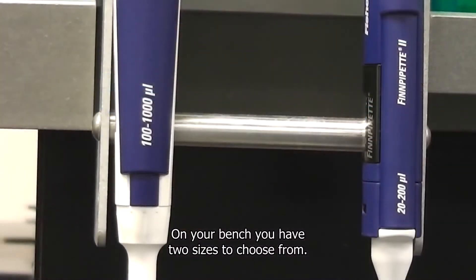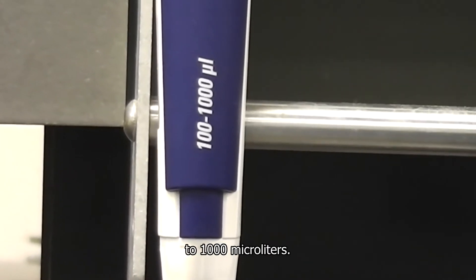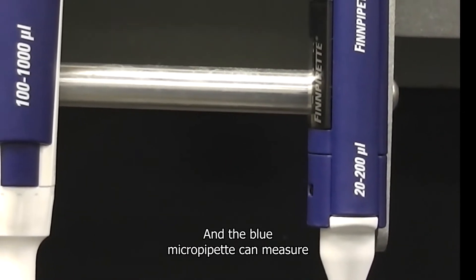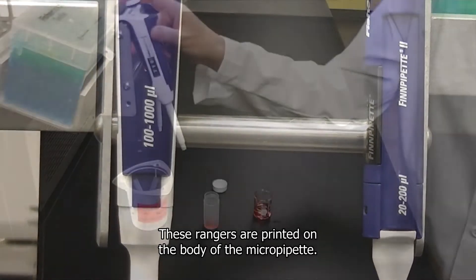On your bench you have two sizes to choose from. The white bodied unit can measure from 100 to 1000 microliters, and the blue micropipet can measure from 20 to 200 microliters. These ranges are printed on the body of the micropipet.